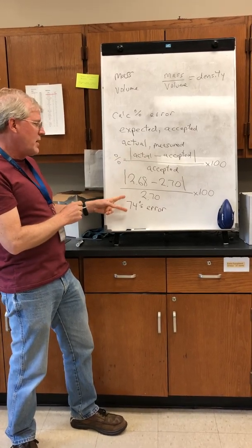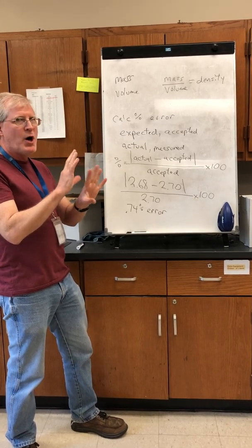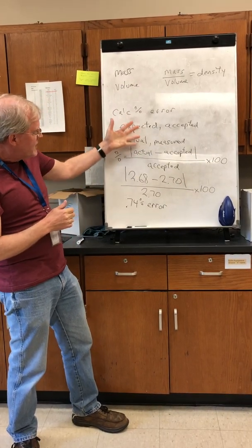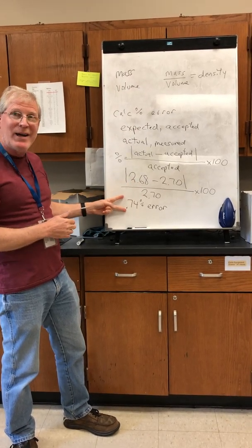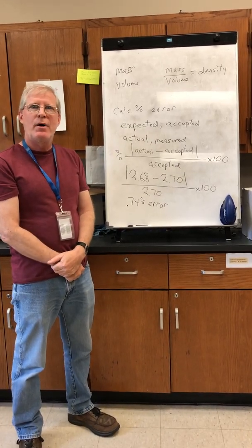If you get something like 5% or 10%, you're really not recording some sort of mass or volume correctly in your experiment, okay? So hopefully this helps you out with how the experiment's done, and probably more importantly, looking at how good of a result you got. Okay, we're going to move on to the experimental part.